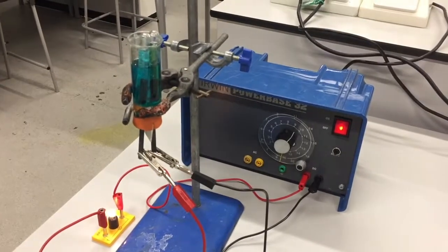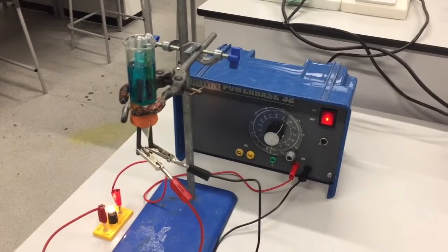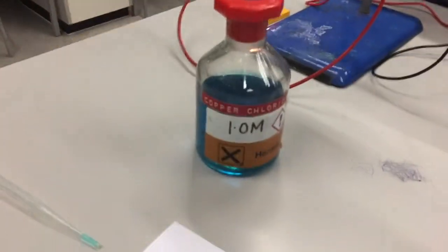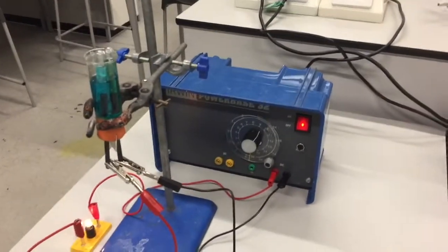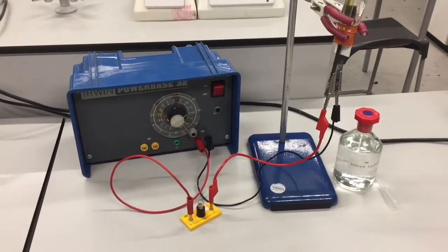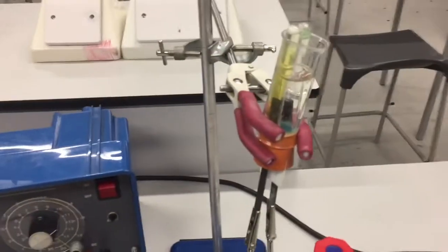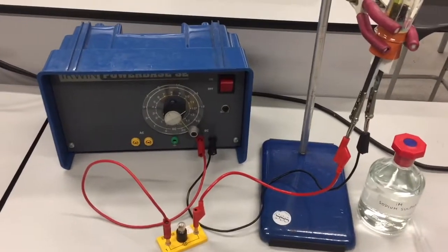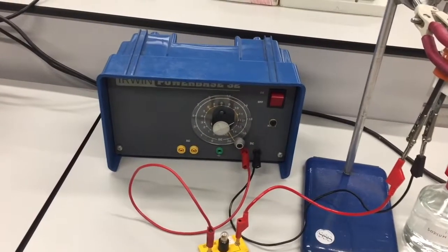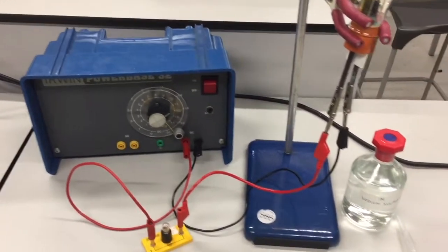Okay, so safety advice for the practical, which is important for everybody, is that we've got two main safety issues. One is, of course, the danger of the chemicals, which are harmful. So we should be wearing goggles, safety spectacles at all times. We're also dealing with electrical current, so at no time while the apparatus is turned on should you touch the electrolyte solution, because that could give you a shock, nor should you operate the controls on the power pack with wet fingers, because that could give you a shock as well.